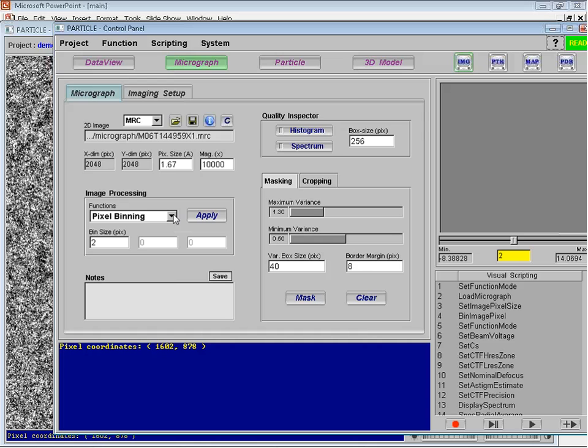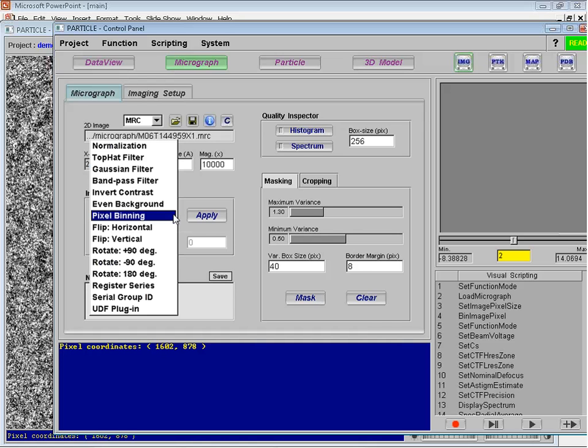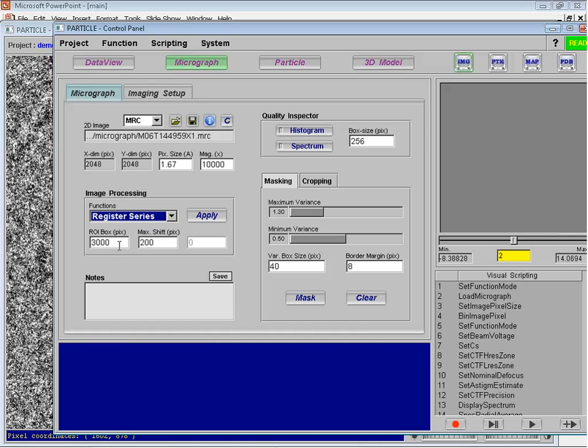Mm-hmm. Isn't your expansion going to be, especially the translational expansion, highly sensitive to the size of the particle? Yes. Of course, in the extreme case, if we have, say, 64 by 64 image frame, the extreme case translation will be like half of the image size, 32 pixels. But of course, if we have a reasonable particle screening algorithm, the particle is more or less centered, then we can reduce this maybe to 20 or 10 pixels, therefore to speed it up. Right. It is a very costly expansion.